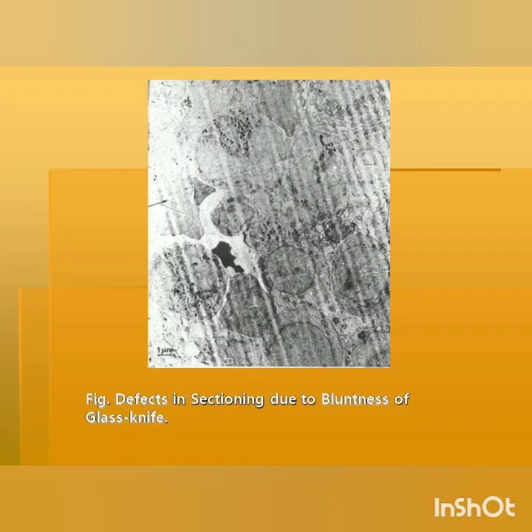This micrograph shows the defects in sectioning due to bluntness of glass knife. The section is actually taken with the help of an ultramicrotome where the knife used is made of glass. Now, if the glass knife is not sharp enough and it is blunt, then this type of knife mark will come and it will disturb the structural features of the section.